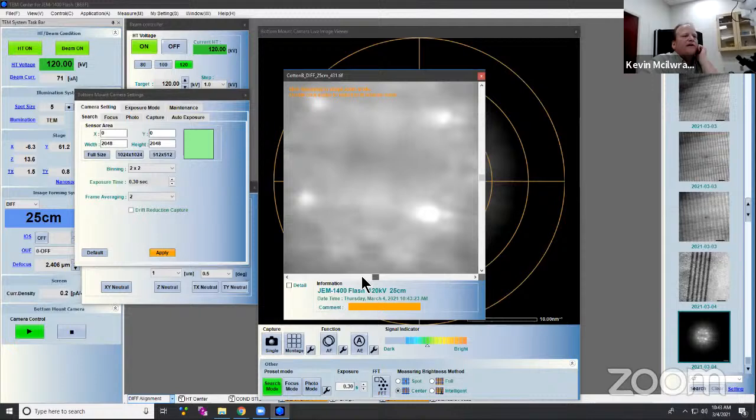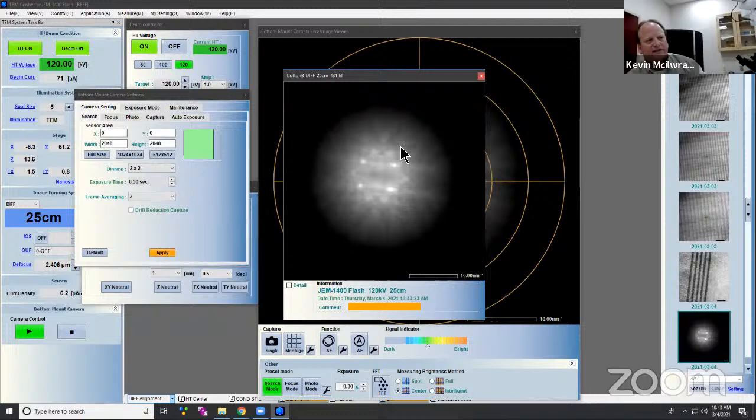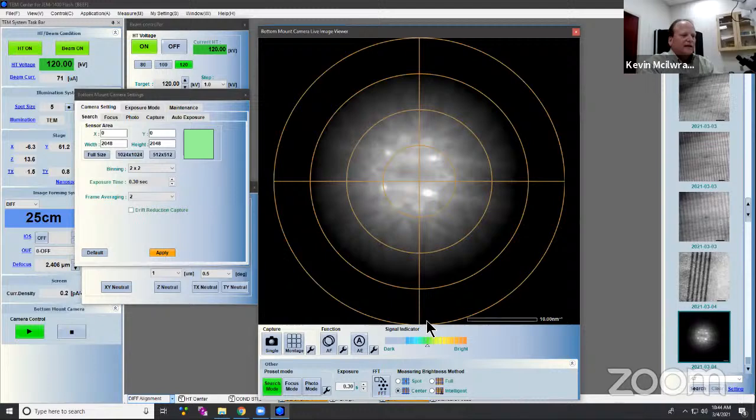It's got a lot of these Kikuchi lines. And convergent beam is interesting in the sense that it gives you some idea of the thickness of your sample. The thicker it is, the more information you get in the center, and it's a lot more complex. But with software and everything, I just imagine we're doing a lot of things at high speed, and a lot of other applications will benefit from this development too. So I go back to my image.